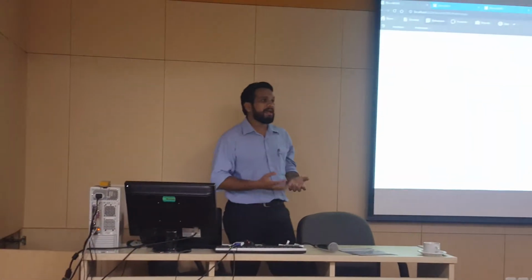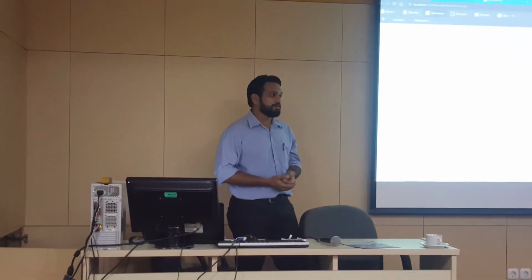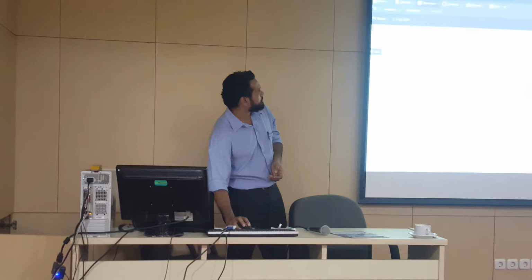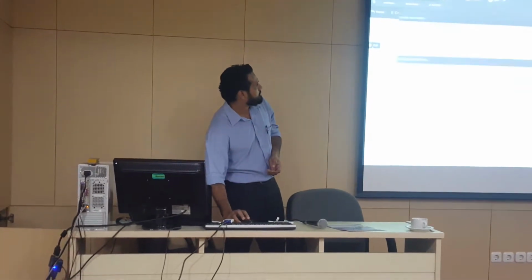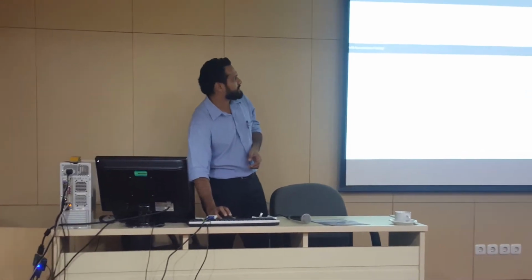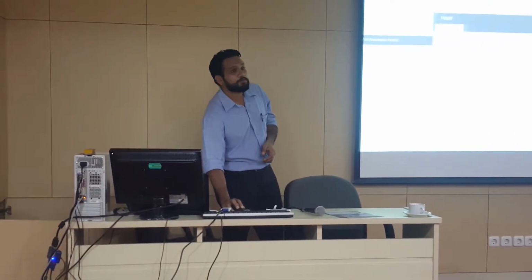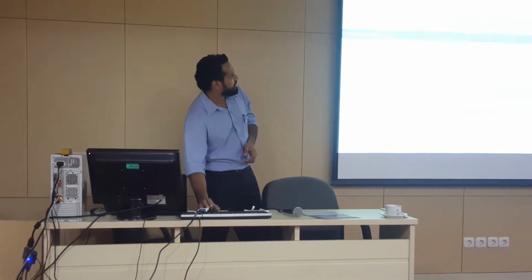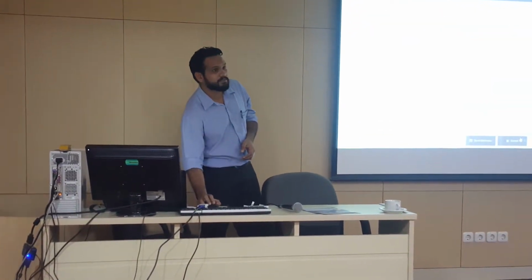If, let's say, you have any annotations that you want to add to your reference, all you have to do is double click on this, click on Edit, and you can add your annotation files here. And again, the upload process is just a drag and drop process to this box. So once you've added your annotation, again, you just go down and you click on Save Reference.